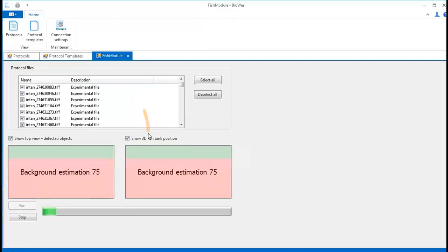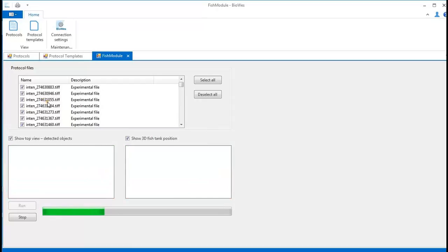So this is the example of specific data processing. So you can see that we have the images. So the module has to know that we work with the images. And then you can implement anything what you want. So if you are using some methods for data processing, then it can be implemented to our BioWES system, or some softwares support also to create a module from the software and plug in to some other system, for example, to the BioWES system.